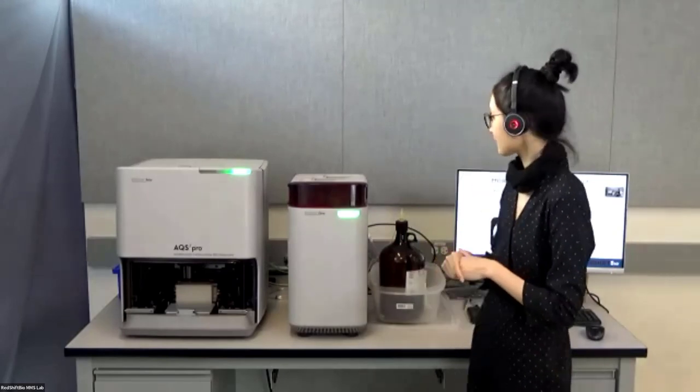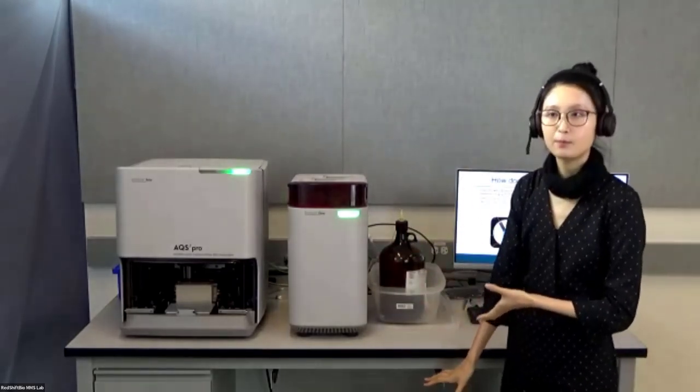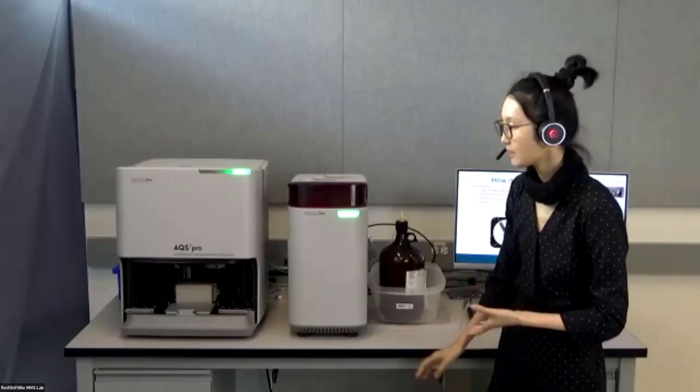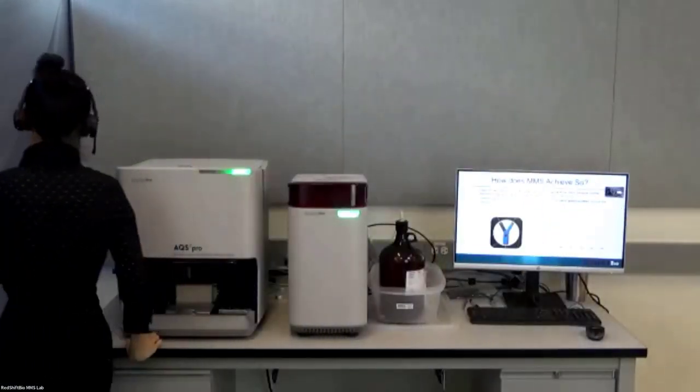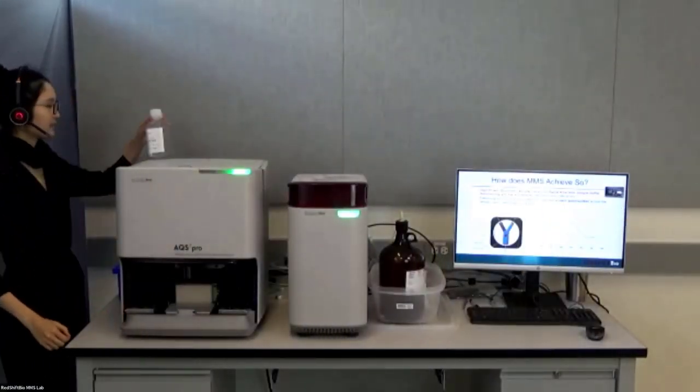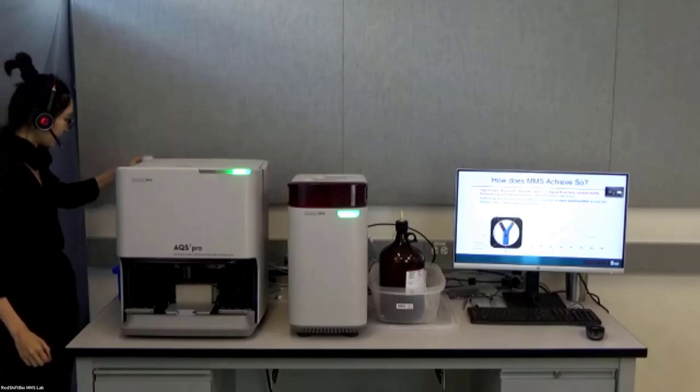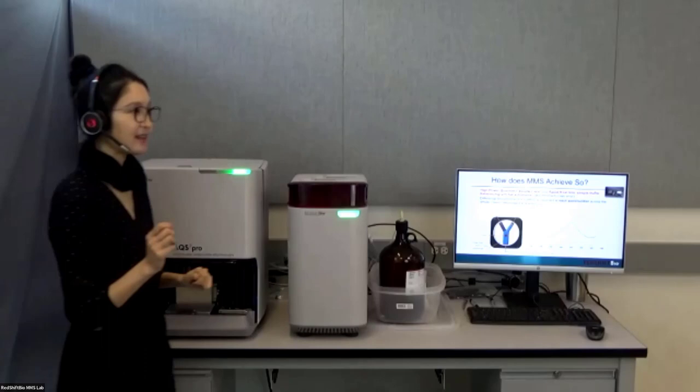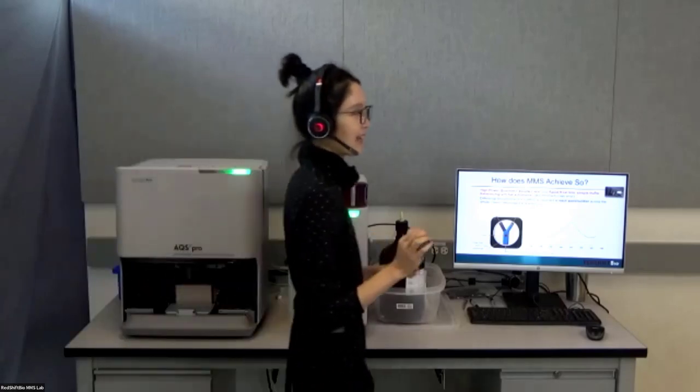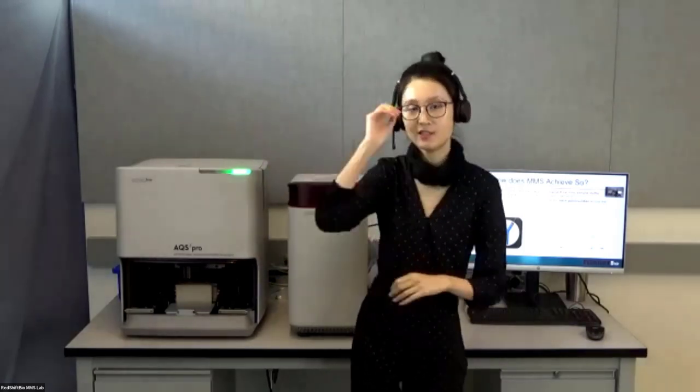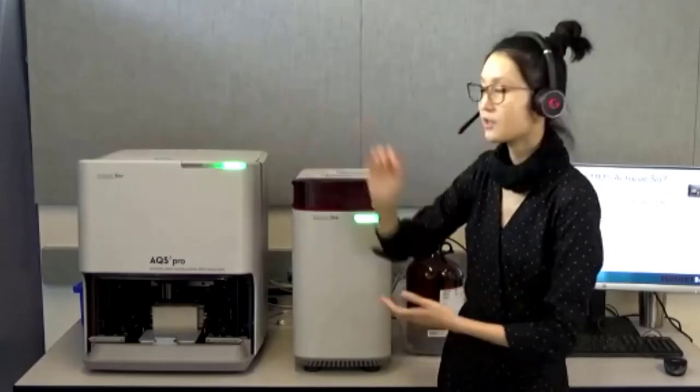There's a waste bottle beneath the instrument. We also have a sample fraction collector. I would like to point out that MMS is a non-destructive technology. We actually have an app note showing that the molecules measured after MMS and collected in the sample fraction collector has no structural changes and is ready to be used for the next thing.